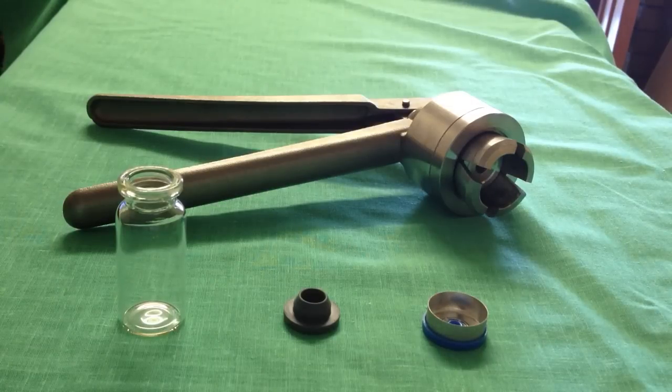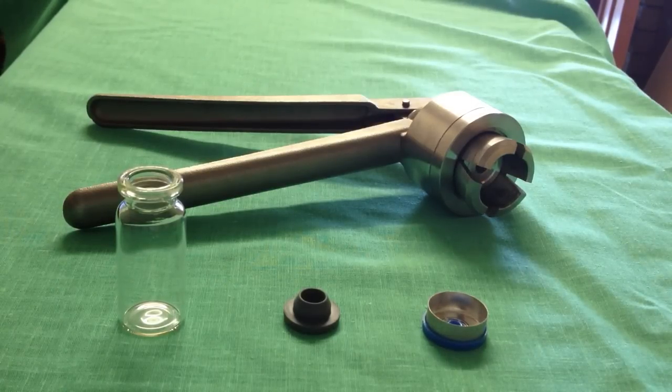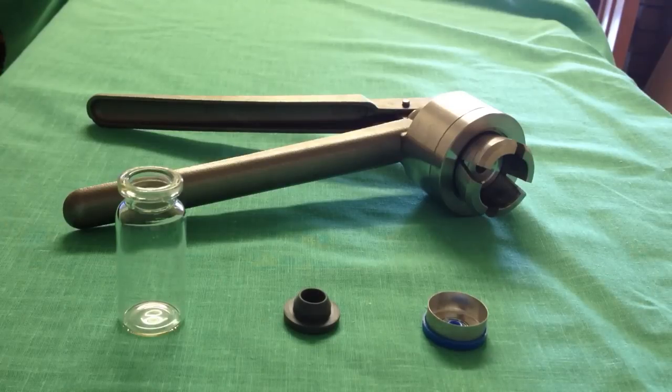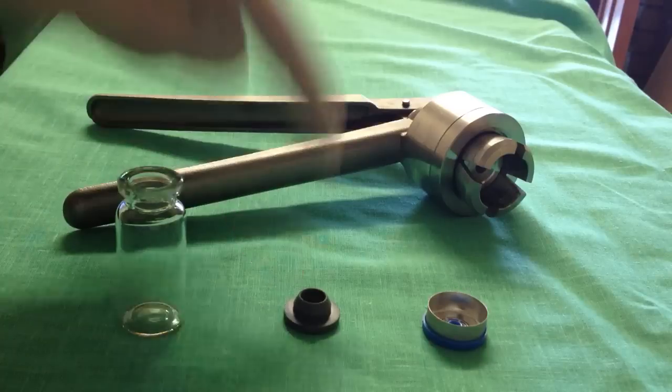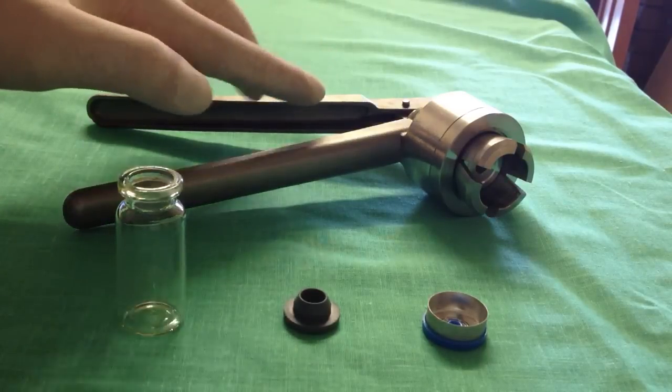Here in this example, we're using the crimper to crimp a cap on a 10mm vial. Now, it's all the same for different size vials. What we have here is the actual cap, the rubber stop, the vial and the crimper.